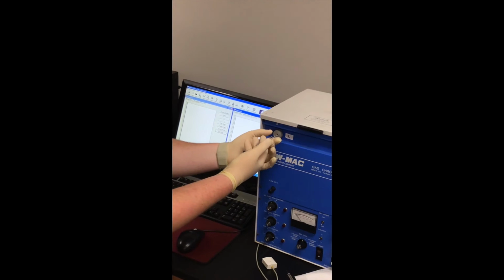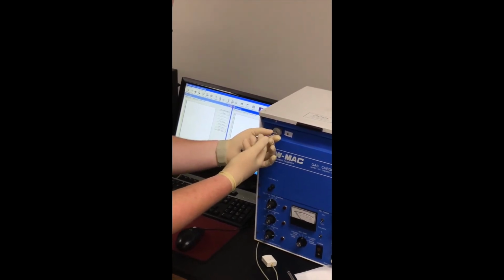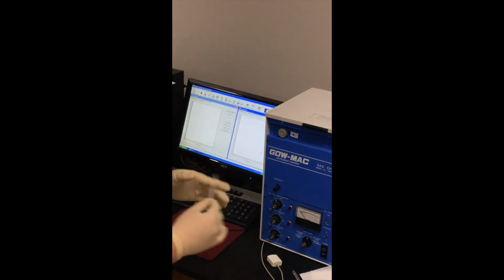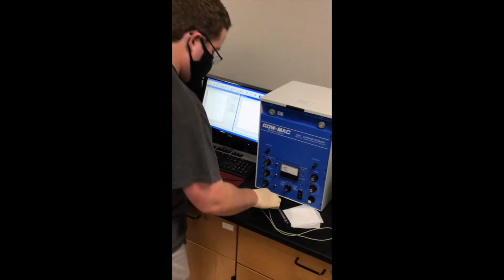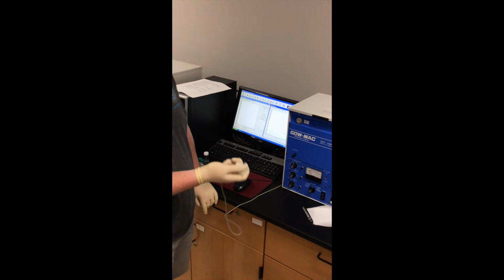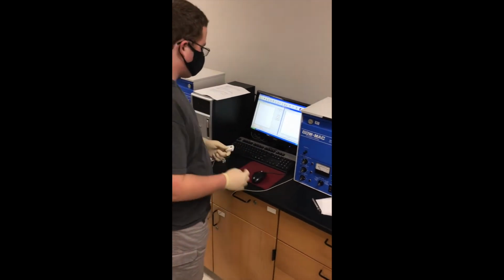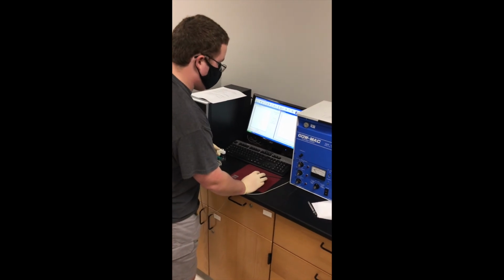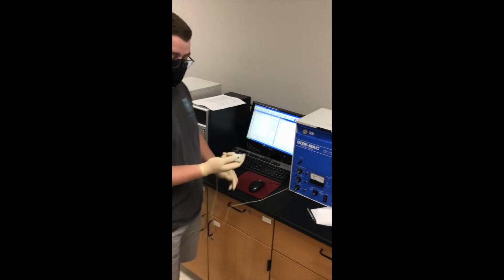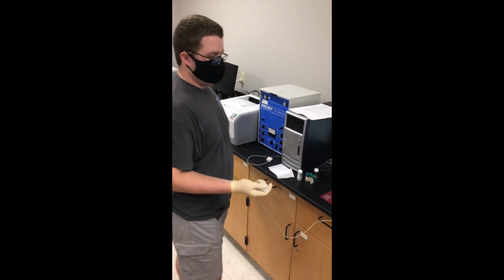Now, your partner would have already set away and would get ready to start the GC recording when you're ready to push it in. At the same time, somebody would take this little piece of plastic right here that's connected to the computer, and this is what can start taking information from the GC. You can do this two ways. You can hit the start button right here in the window, or the start button here. These windows are identical. Or this will do the same thing. And that's easier. You can have somebody stand away and press the button at the same time.